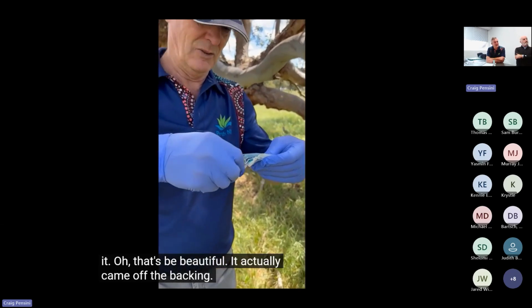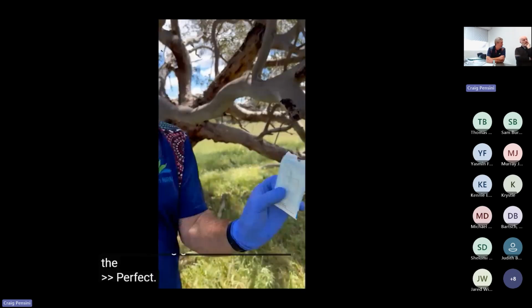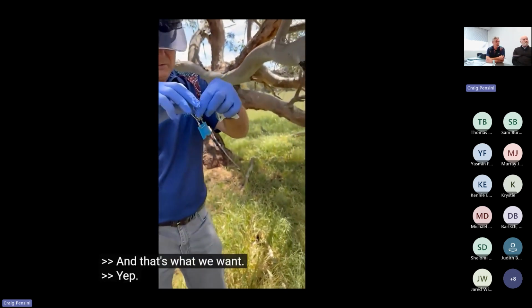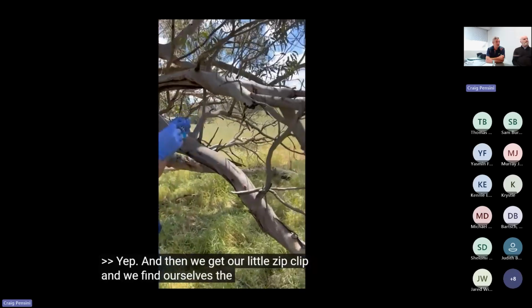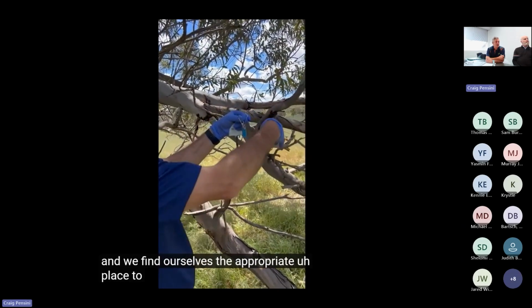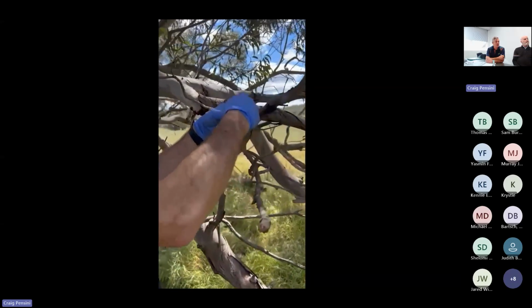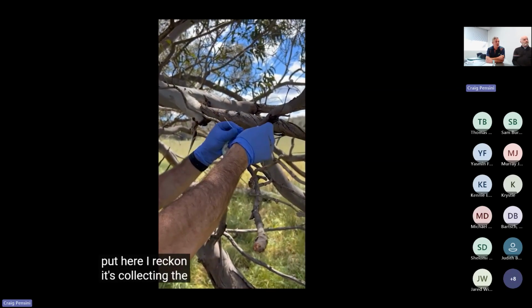So this is the air sampling kit. It's actually quite simple, probably the easiest to deploy of all of the sampling tools that we used. Basically, it comes out of that sterile package, and then there's a zip clip. You find somewhere at the appropriate height, in this case a tree, and you adhere it or zip clip it up in the tree.